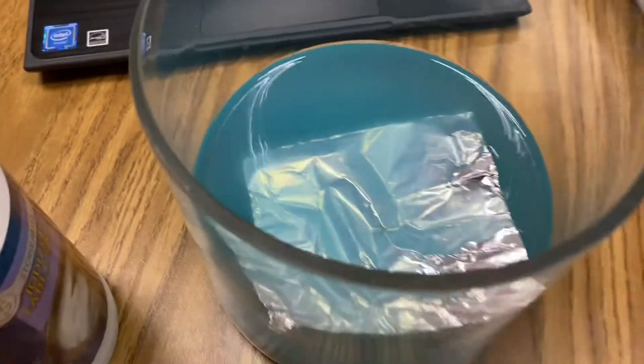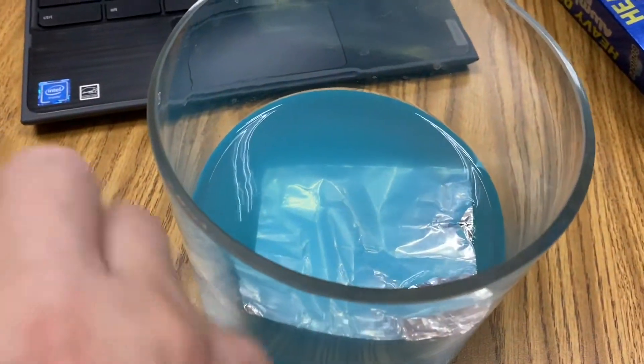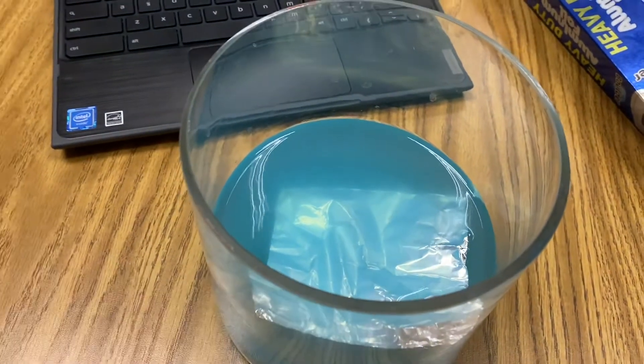So I'm gonna add a little bit of salt, and that will speed up the rate of this reaction. So here's my salt I'm gonna add.